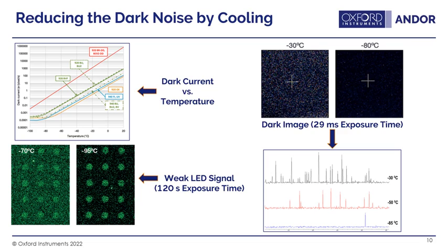And you can see that in most cases, there's a linear relationship between dark current and temperature down to about -80 or -90 degrees Celsius, and then it starts to flatten out. And while this graph has some good information, I think it's also good to see this effect through pictures.